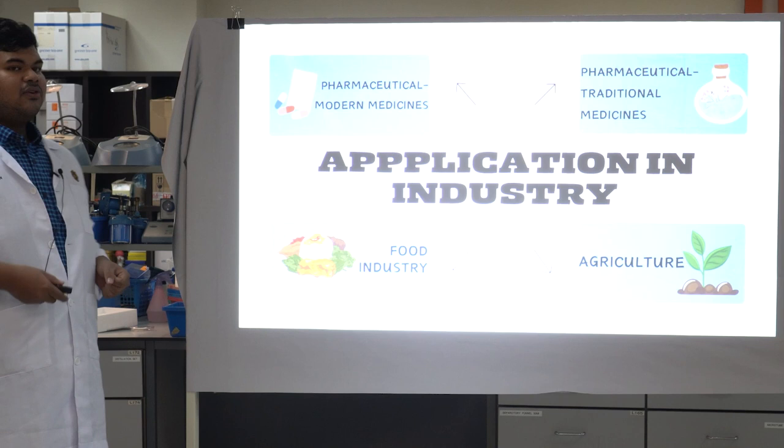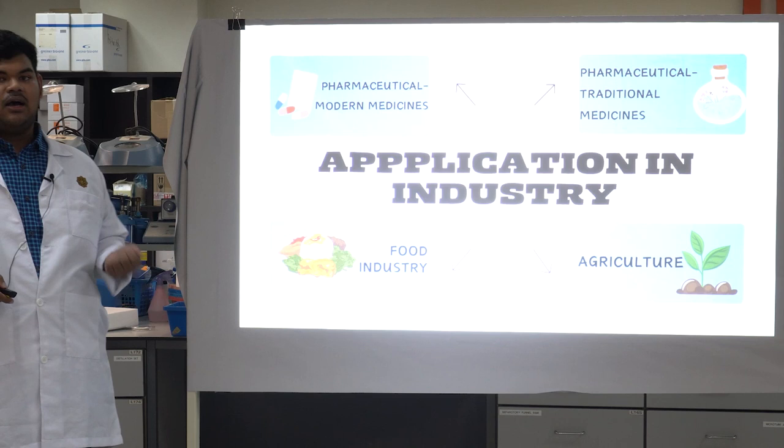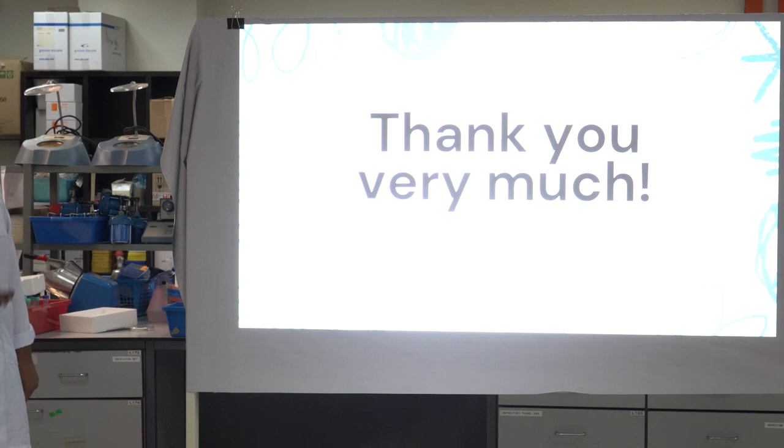And also, a company can use TLC to develop new products, such as doing screening for desirable new flavors and also for new aromatic compounds. So that's all from us. Thank you.